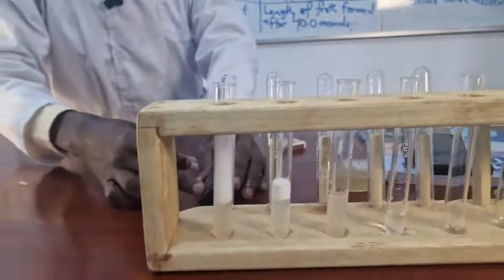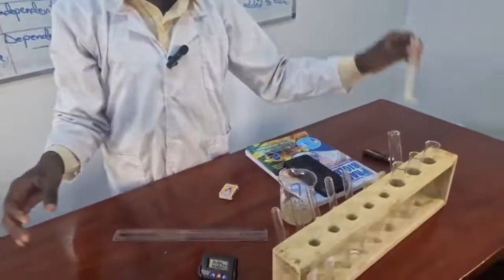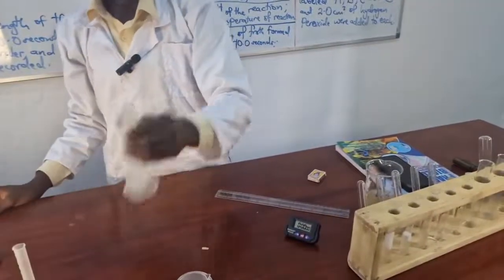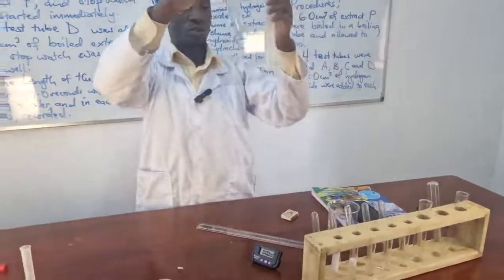I'll stop my stopwatch and rewind it. We are now going to test tube D. To measure the extract, I'm going to use this one.